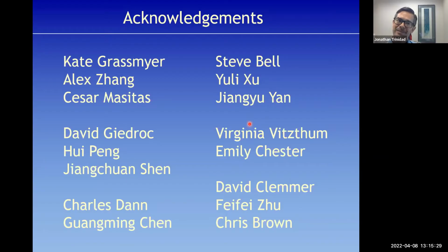But I guess the first thing I would say is, I would need to look up how people have biochemically characterized, quote, detergent-resistant cell membrane proteins, mass spec or otherwise, because I'm not even sure how you, because you could take the cell. I mean, there's always harsher things, right? 8 molar urea with 1% SDS is pretty much going to dissolve everything, I would think. You could imagine something crashing out of that solution, right? So it's still tricky, but you could take that.